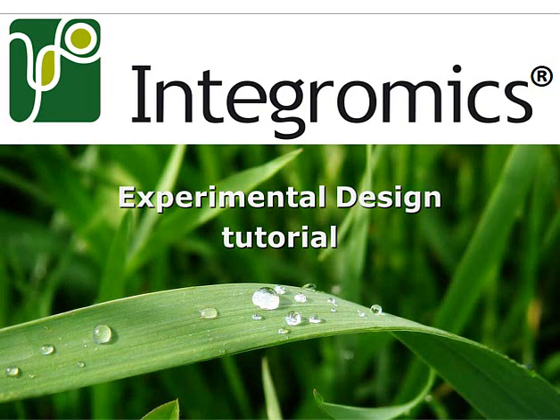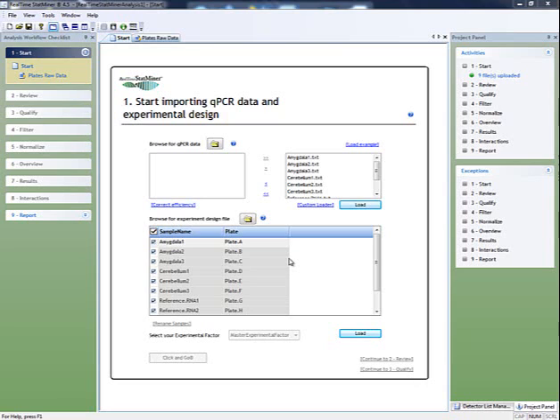Assuming that we've already uploaded our qPCR data into the application, it is now time to define the experimental conditions of the analysis. These conditions can be defined in two different but compatible ways: by loading them from an already predefined text file, or creating them from scratch by editing the design panel.